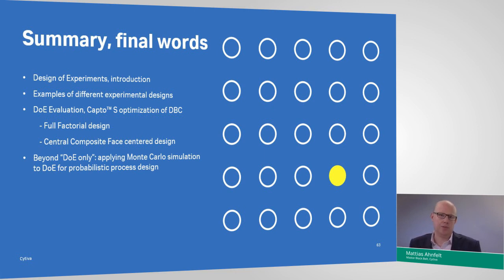So therefore, we didn't proceed with the evaluation of that data, but instead extended the design with the star points, 2 experiments for pH to enable us to quantify if we have a curvature in pH, 2 experiments for salt to enable quantification of possible curvature effects from salt or conductivity. And indeed, we found significant curvature in both pH and salt.